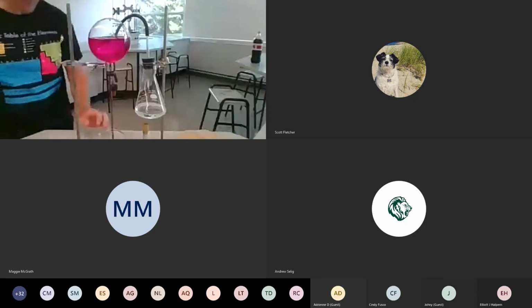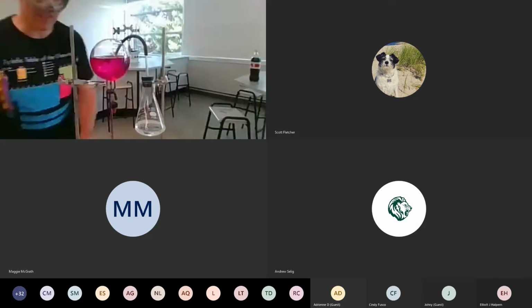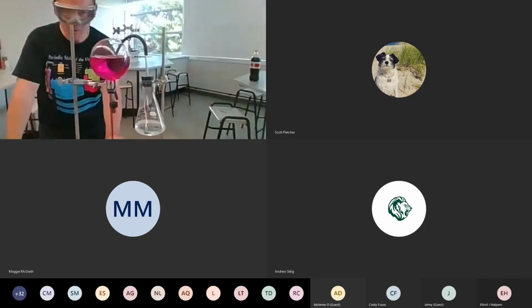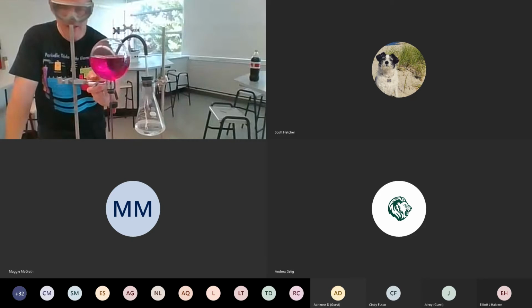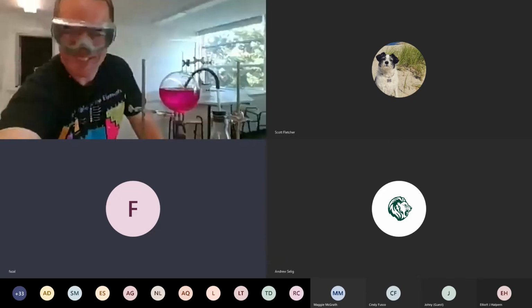Okay, so a couple things are happening. A little bit of acid-base chemistry with the pink that happens. But what I wanted you to notice is that just like a solid will disappear, we can notice that about 2/3 of this gas actually disappeared. This was full. I had no way for the gas to get out. There was only liquid going in. And so just like a bit of sugar dissolving in water, the gases will also disappear and go into solution there. So a few things going on with that.